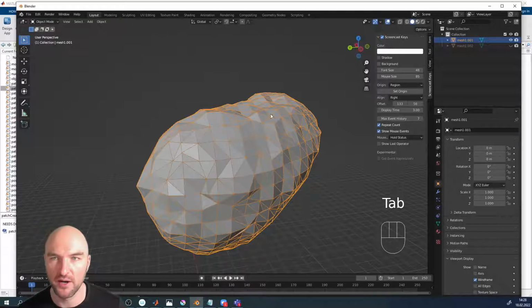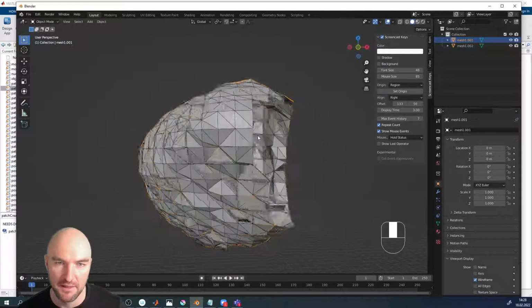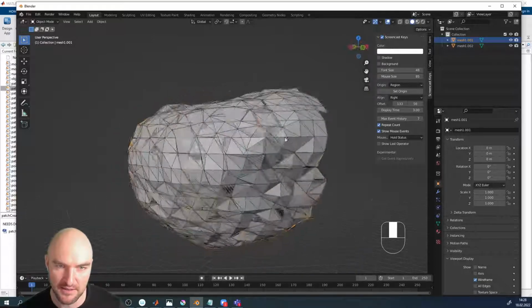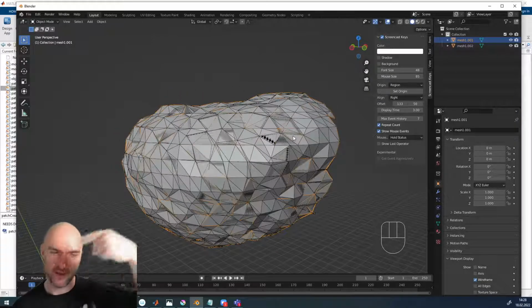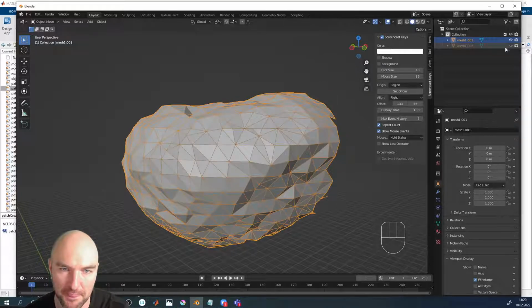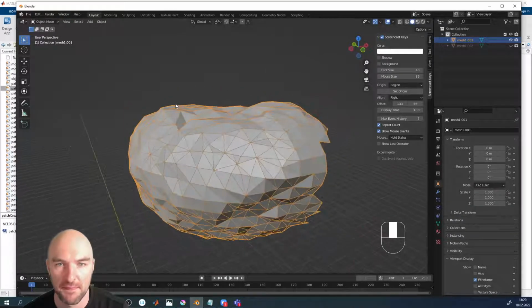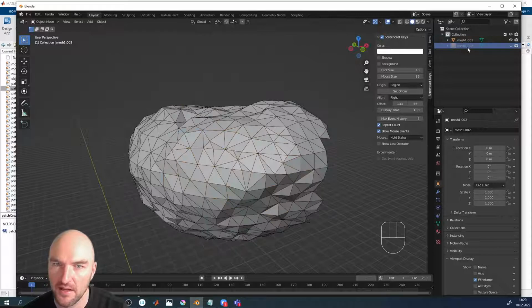And so let's move out of that, and we can now compare that to the original. And you can see the actual distance. If we go into isosurface distance, the surfaces are still fairly identical, but this one is just a much cleaner mesh. Okay, so this is one way of doing it.